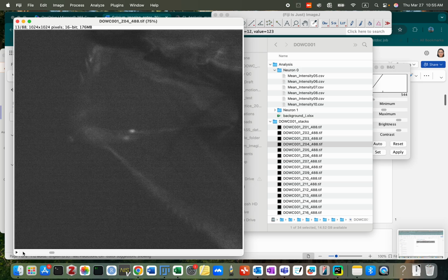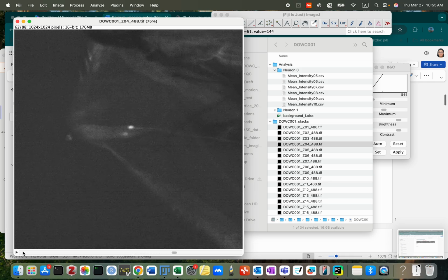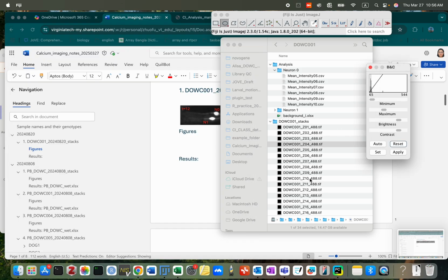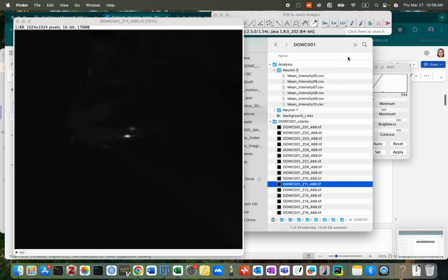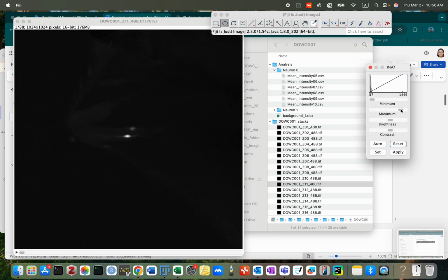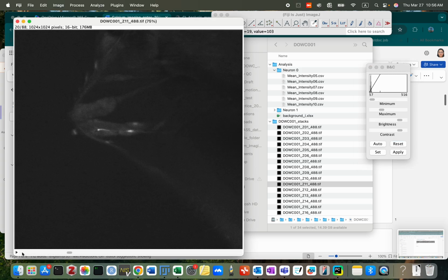The signals are quite weak in the beginning. Let's see the following time points. I think it's still weaker than the previous Z stack. I will stop at this moment. Okay, so in this direction we started from 0, 10. Now come to the other direction, Z stack 11. Oh, I think it's weaker than Z stack 10. So 10 is really the center of the cell. However, I see a brighter point, so I need to work on this stack.